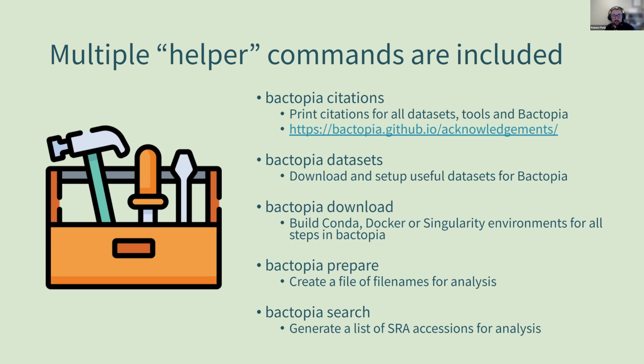The Bactopia download command will pre-build your Conda, Docker, and Singularity environments for all the steps in Bactopia. This is especially important with Conda because Conda does not like to build environments in parallel. And by default, Nextflow will attempt to build environments in parallel. And so what happens is there will be lock files, and one environment will be being built, another one will start and try to access this lock file, and then it just explodes. So to circumvent that, I created this Bactopia download step.